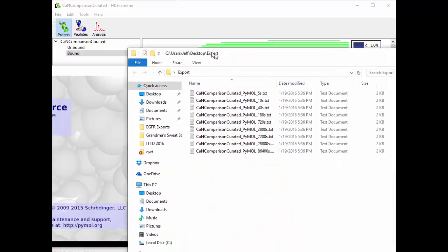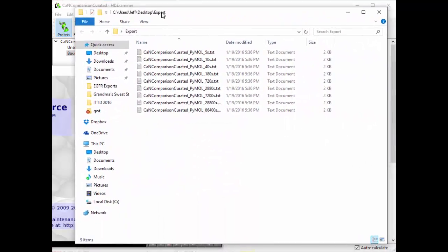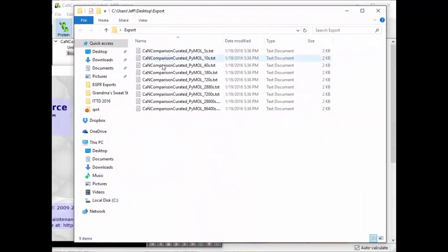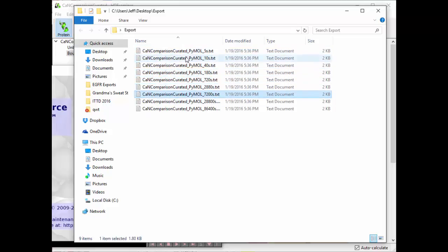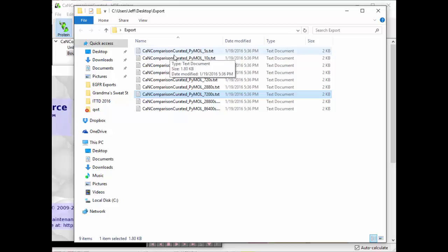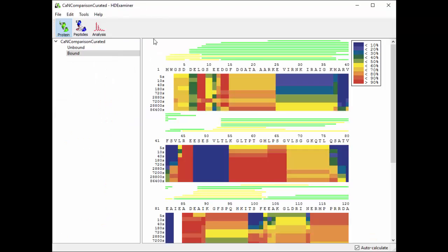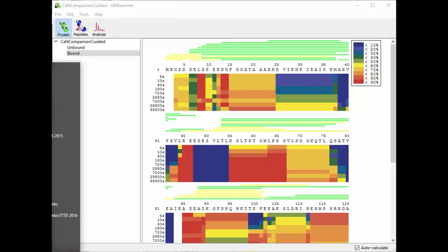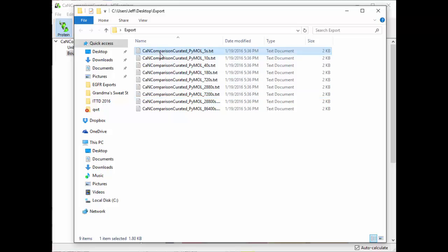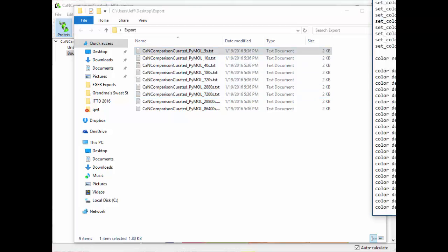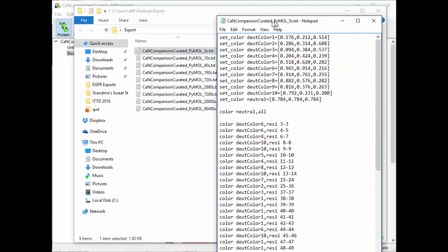Here's that folder I just saved into. What you get is a whole bunch of different text files, one for each time point, and each of these files represents one row of your heat map. So the five second one starts off yellow and then green and red and so forth. The ten second one, etc.